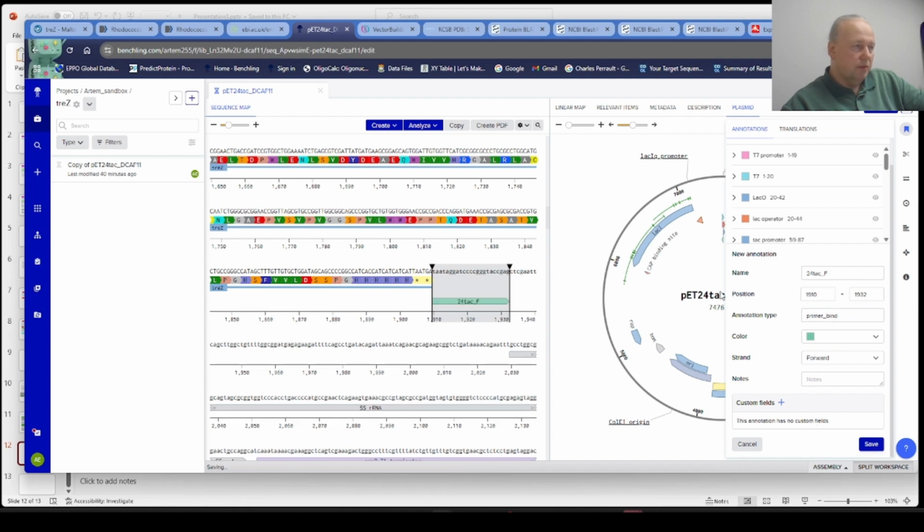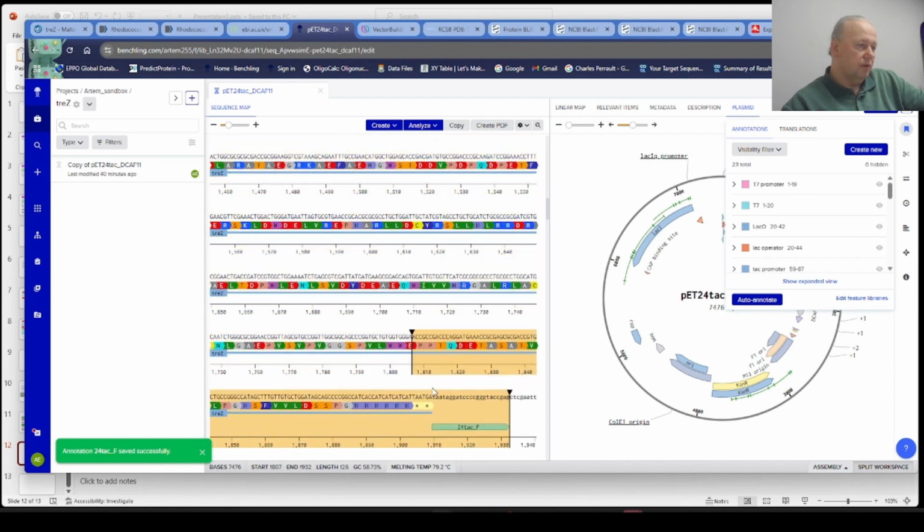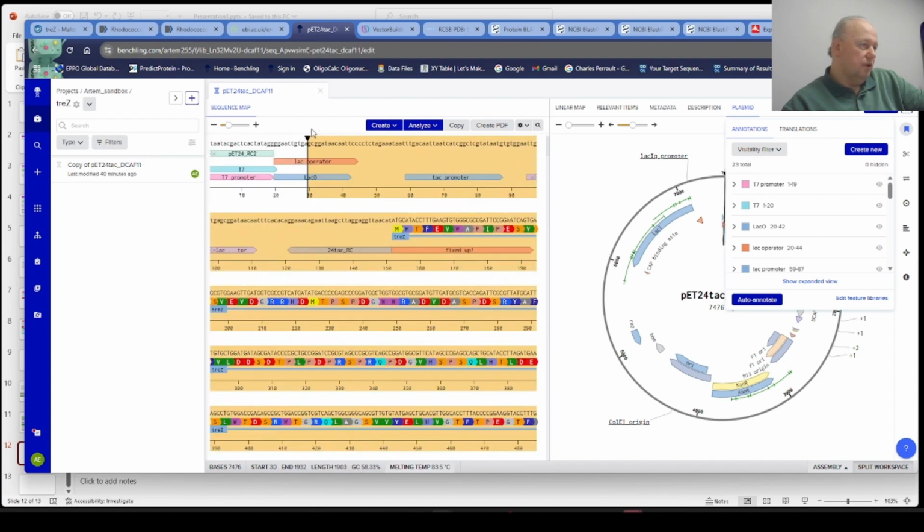See, so what will happen is we'll order a synthetic gene going from the end, including the primer, which by the way is 23, so it's enough, all the way to the beginning of the gene, also including the primer. This would be a synthetic gene that will then be what I used to call cold fusion, now it's called NEB quick assembly, whatever, will be cold fused into the vector that has been amplified with these primers, creating a long piece of DNA that will align.